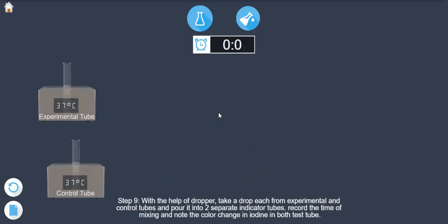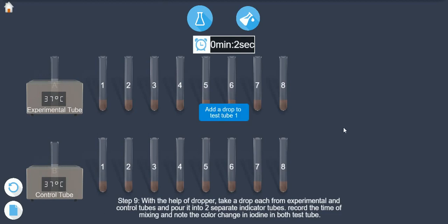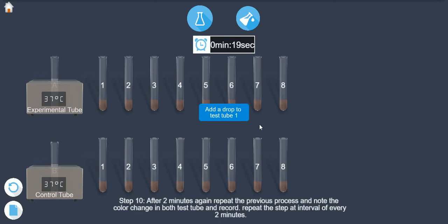Step 9: With the help of a dropper, take a drop each from experimental and control tubes and pour it into two separate indicator tubes. Record the time of mixing and note the color change in iodine in both test tubes.